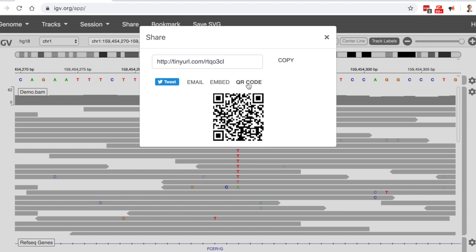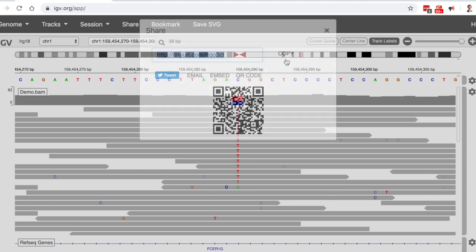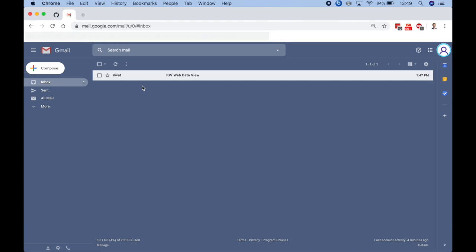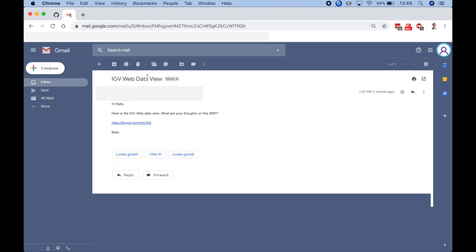In all cases, the interactive data view will be the same. These different options are just for the purpose of convenience. Here, I'll choose to copy the URL and email it to my colleagues. When they click on the link in the email, they'll be able to see and interact with the data view.